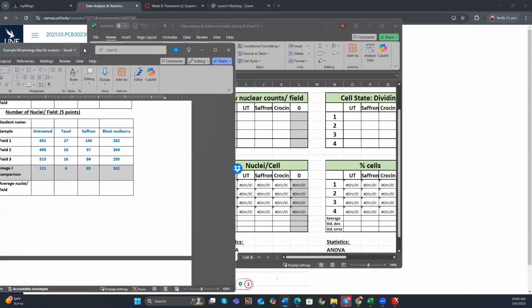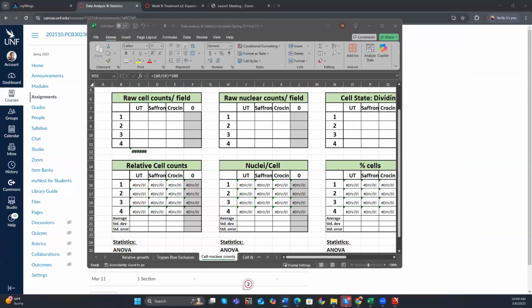And we can do the string. There you go. And you're gonna do the same thing here, right? So you're gonna put in your data. And this is where sometimes it can have a mind of its own. I haven't figured out what makes it one way or another, but sometimes it doesn't like it and does weird things. So just be aware. Saffron is right here.